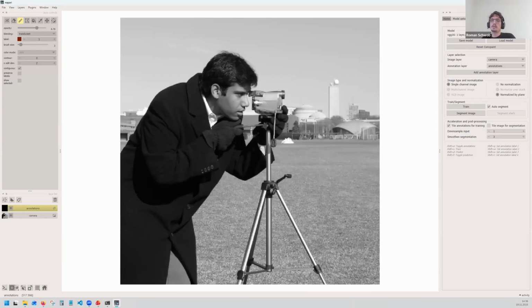The only thing that's really important to keep in mind is what I said about the difference between semantic segmentation and instance segmentation. Whereas you could technically also distinguish left eye and right eye, for example, this is still a semantic difference, right? But you should not confuse it with differentiating one instance from another.